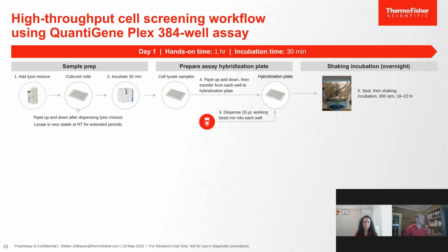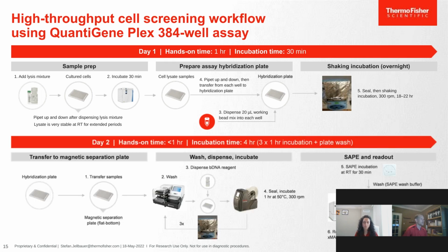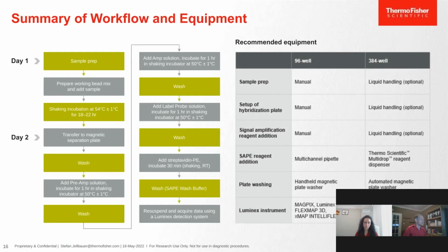As you can see from the number of steps, while hands-on time is fairly minimal, there are various touch points in the workflow that require lab technician time and effort for incubation, washes, pipetting, transfer steps, etc. Here on the left is a simplified view of the different assay steps for day 1 and day 2 that I just showed you in more detail on the previous slide.